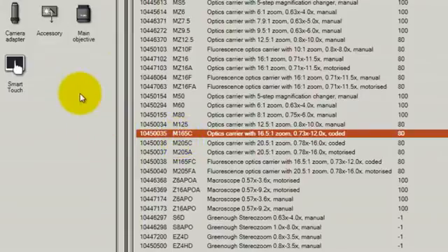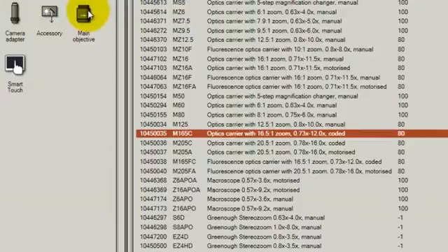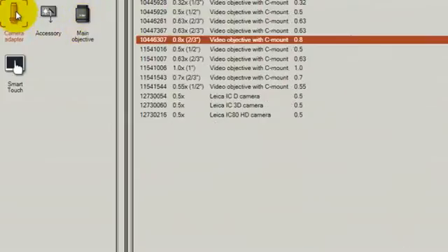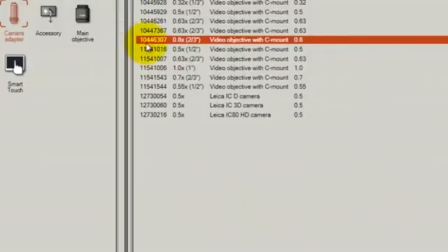But the type of camera adapter and the main objective are not detected automatically. These are not coded features, and therefore we need to make sure that these are selected according to the item that is actually being used. In this case, we've got a video objective with a 0.8x magnification.